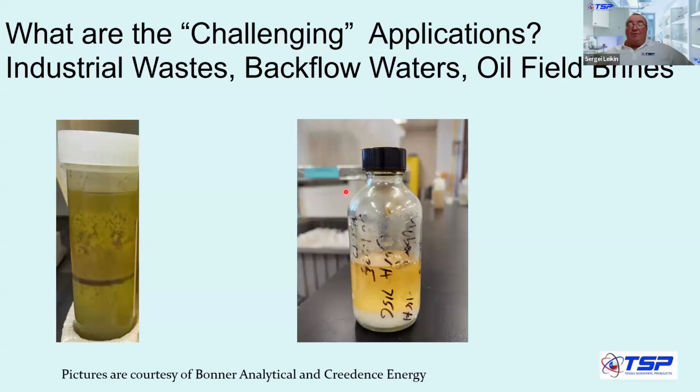So then we're moving from organics to aqueous samples, so kind of in reverse. Here are a couple of examples of aqueous samples. Here is one of industrial waste that has a couple of percent of PCBs and diesel, and you name it. And you see there is a separation of aqueous and organic phase here.